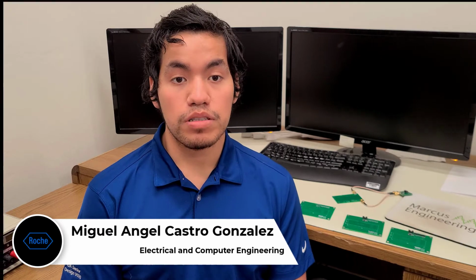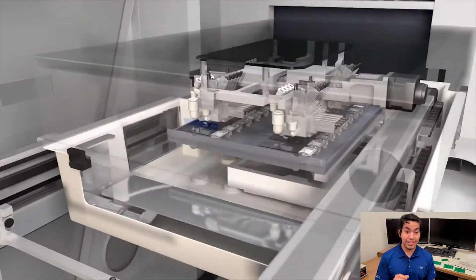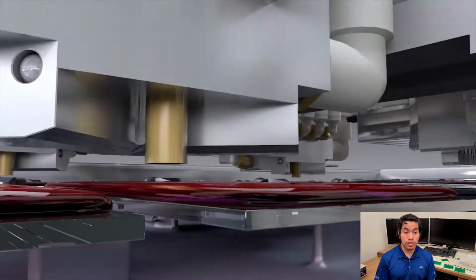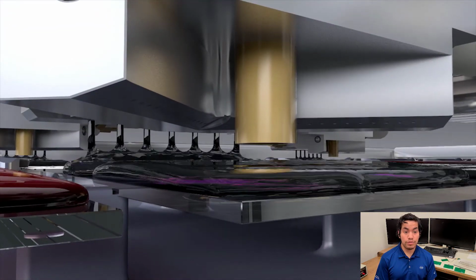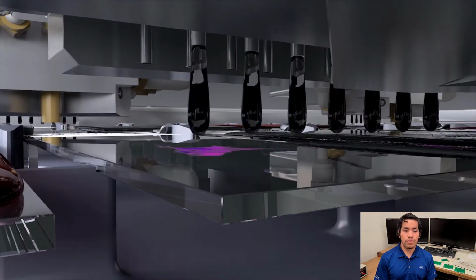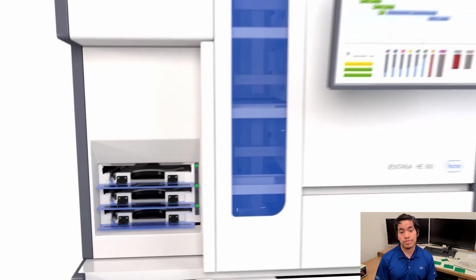Our team works with Roche Tissue Diagnostics, a producer of cutting-edge tissue staining systems that are used in labs around the world. The staining system adds and controls volumes of reagents at microliter scale during staining, which can last hours. The amount of fluid on the slide is one of the most critical parameters for their system staining quality and one of the hardest to measure.